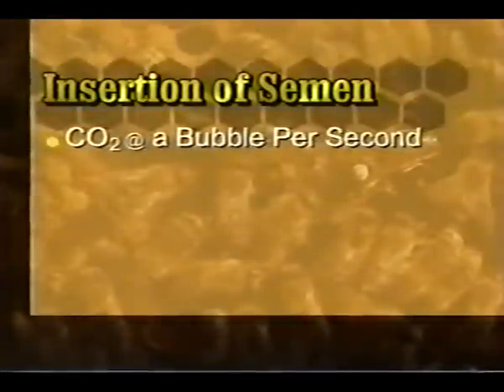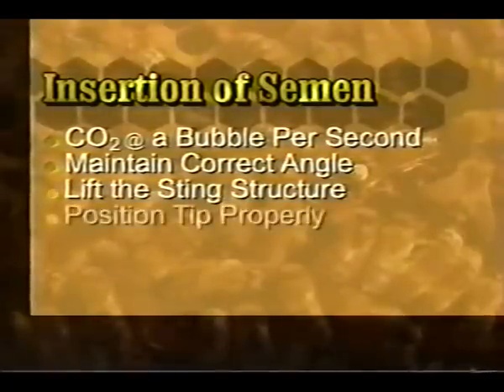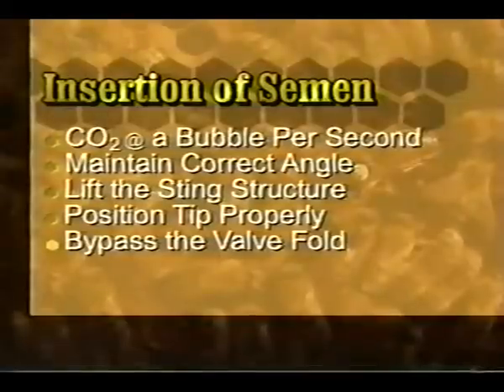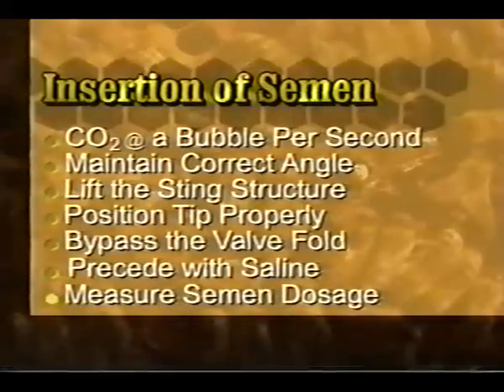During insemination, observe these points carefully: adjust the CO2 rate to a bubble per second; maintain the correct angle of the instrument; lift the sting, avoiding pressure on the poison sac; position the tip above and to the right of the V; use a zigzag movement to bypass the valve fold; proceed the insemination with a drop of saline; and be sure to measure the semen dosage — eight microliters per queen is standard.